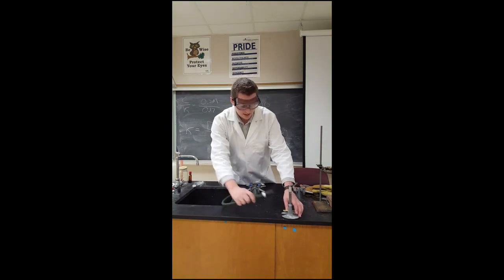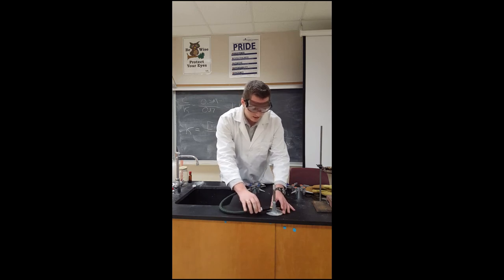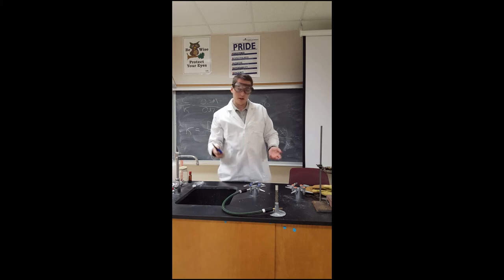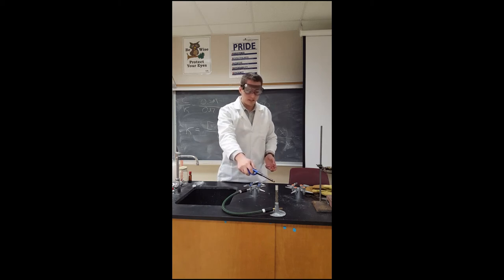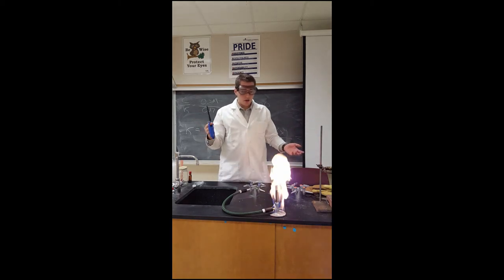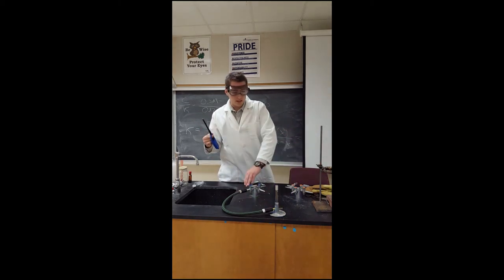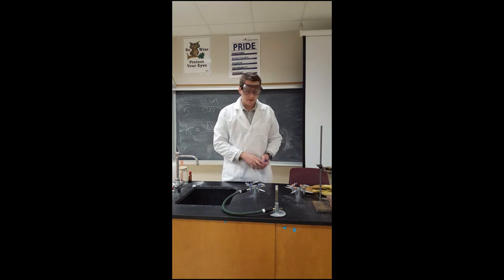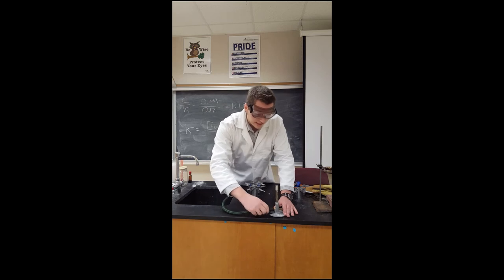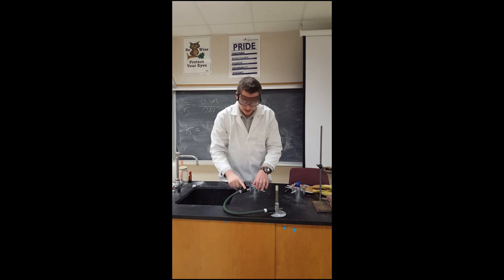Something else: if you put this tubing on here and you don't make the connection tight enough, hopefully it'd be obvious what would happen — but we've got a little flame at the top and also a leak down at the connection. That's very dangerous. We've got to make sure that the connection down here is very secure — pull on it, make sure it's good to go, make sure the connections are tight. Now the gas is going to be directed all the way into the burner.